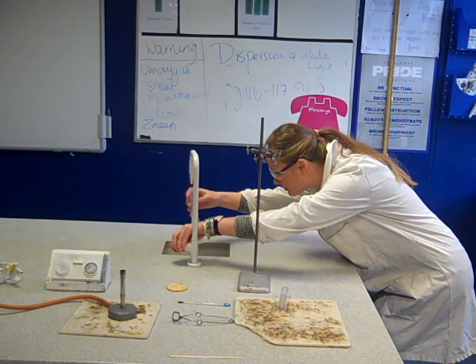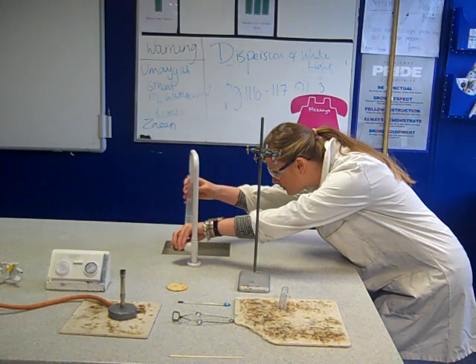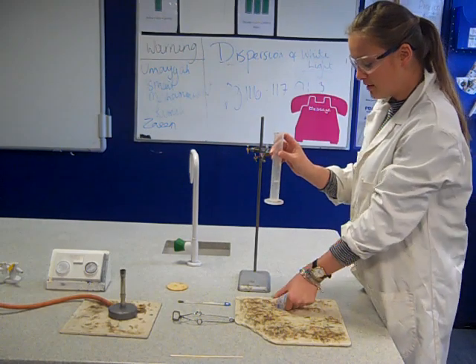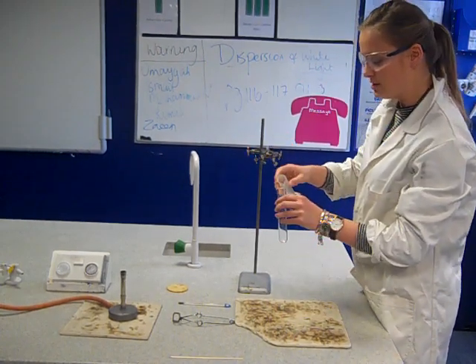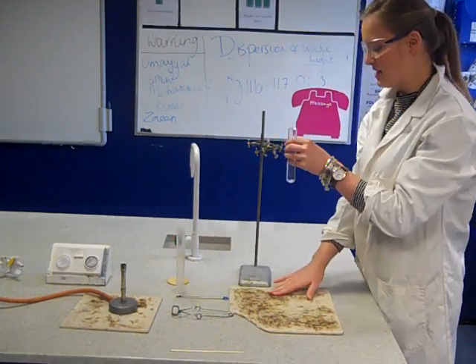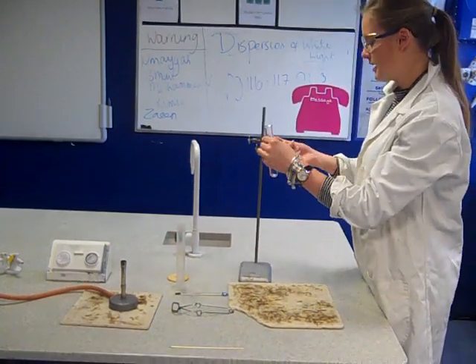Oh, put a bit too much in there that time. Okay, so I've got my 20 mils in there. I'm going to pour that into my boiling tube. Okay, now I'm ready to clamp this into my clamp.